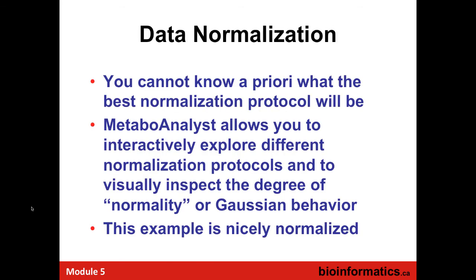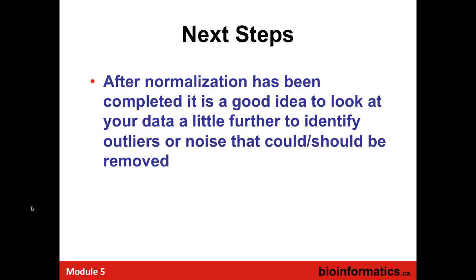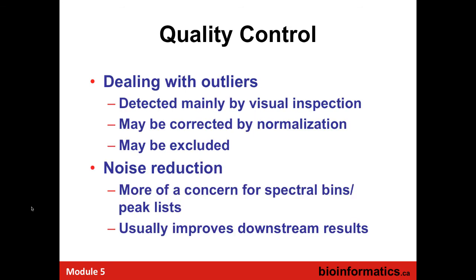So as I said, we've got a new version for MetaboAnalyst, version 3.1, whatever, that allows you to interactively do this. It is important to do it visually. After you've done this scaling, transformation, normalization, you want to be able to look at this data a little bit closer and to do a little bit more quality control checking.